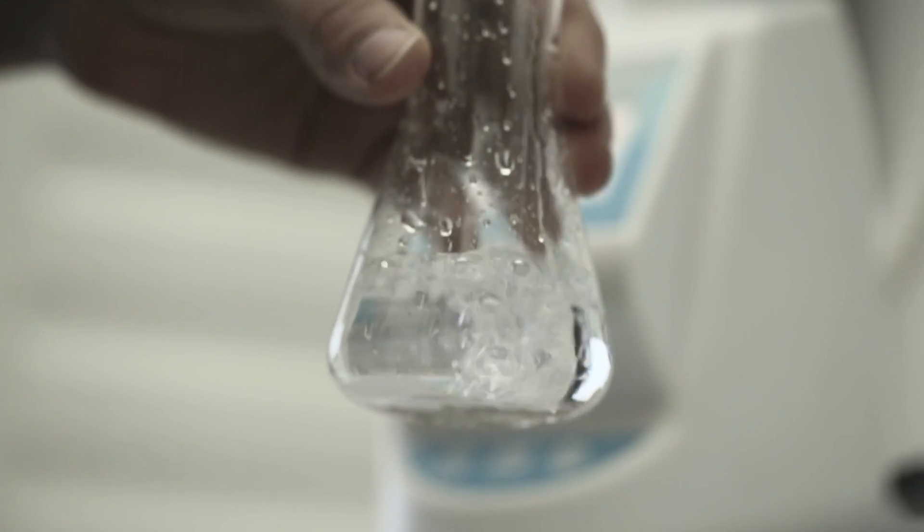This is the story of eVaqua. Now the purest form of ultra-clear water for Planet Blue's future. In your lab.